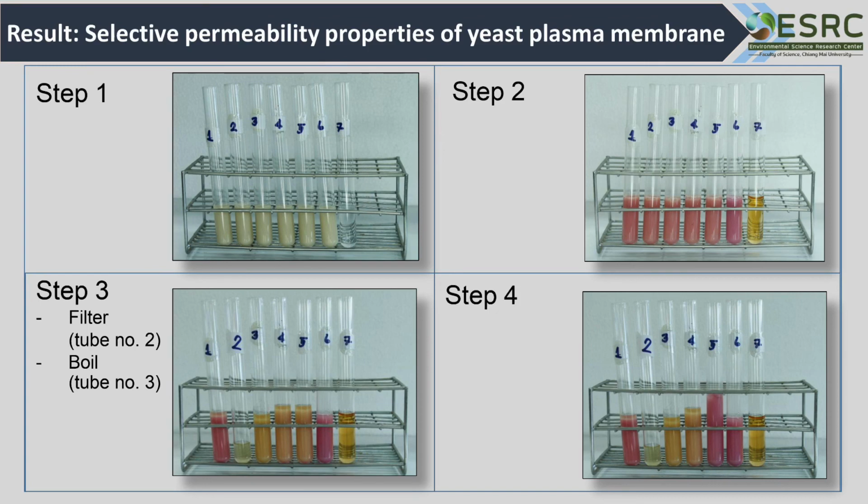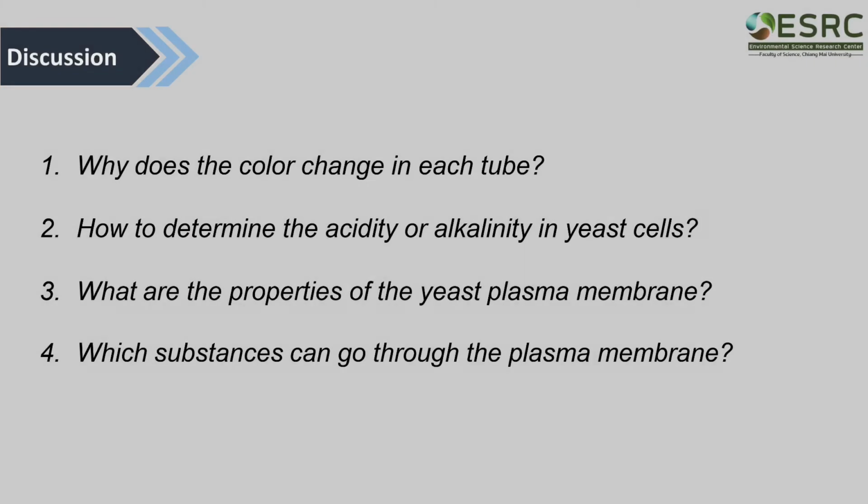These pictures show the results in each step. The results of tube number 2 and 3 in step 3 were filtered and boiled respectively. Students may pause the video and record the color and discuss these questions.